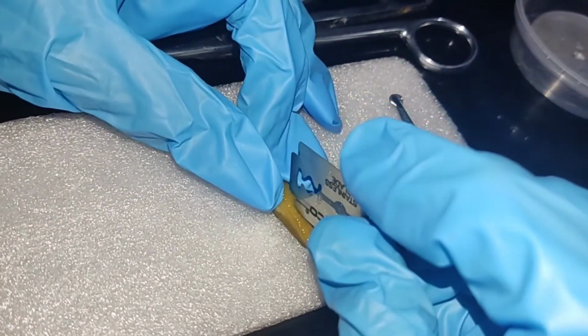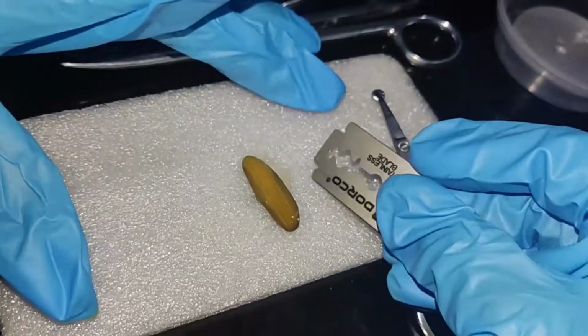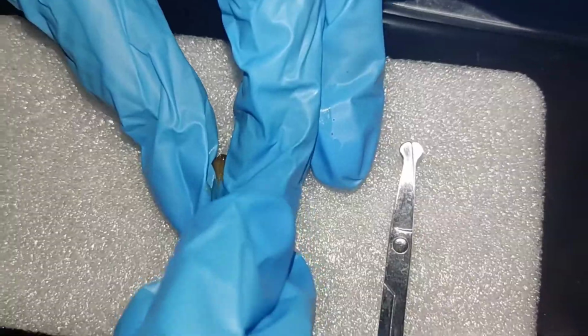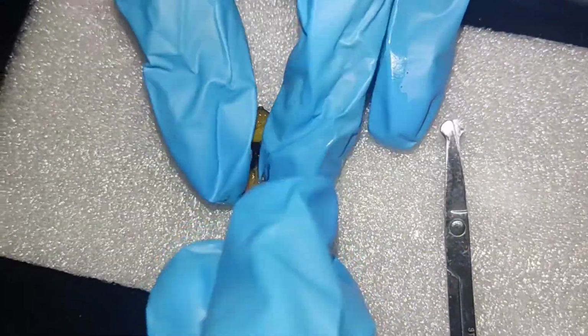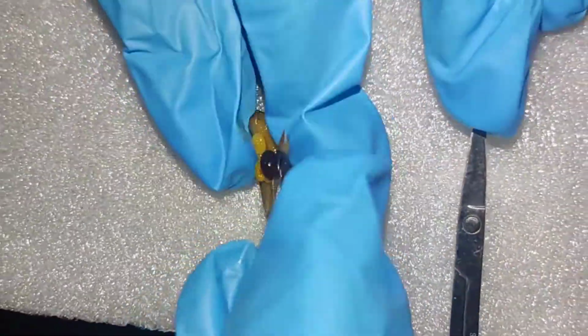Make a shallow incision near the tip of the tail using a pair of sharp dissecting tools. Make sure not to damage the internal organs of the slug. It is better to use pins in order to stabilize the slug.